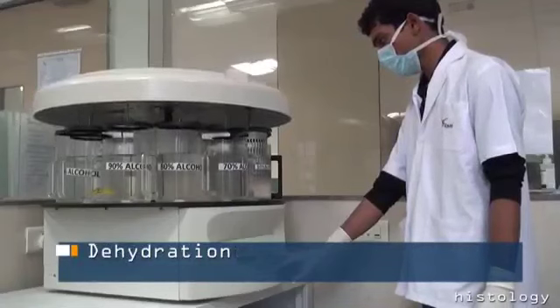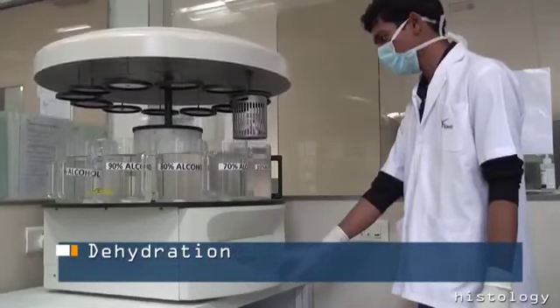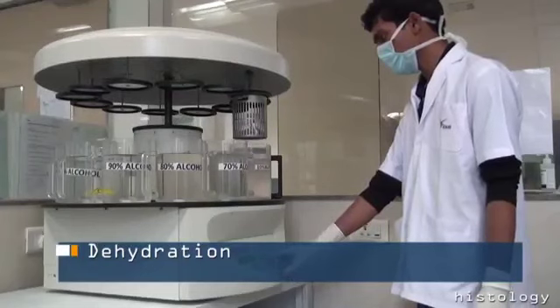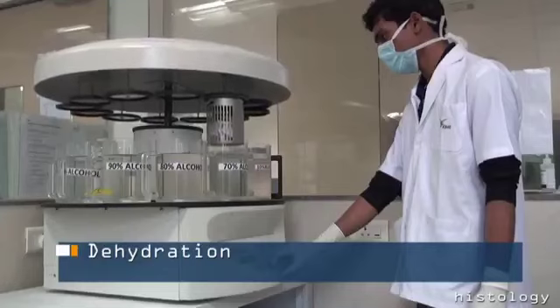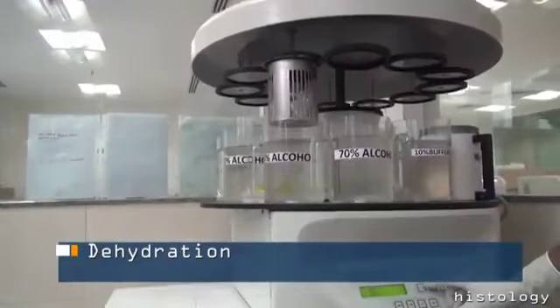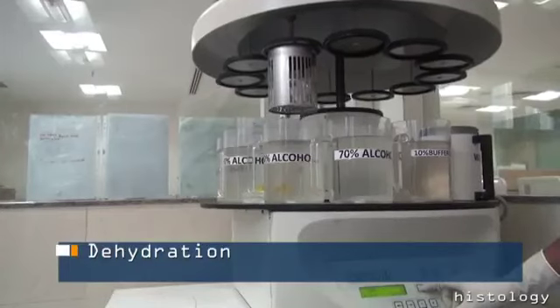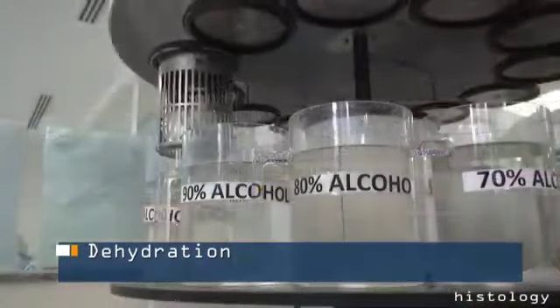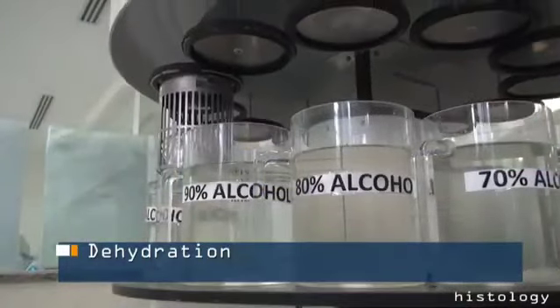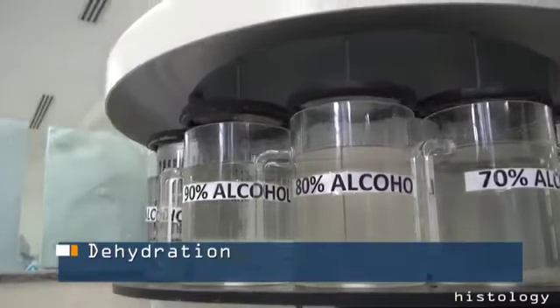Dehydration. Water is present in tissues in free and bound forms. Tissues are processed to the embedding medium by removing the free water. To minimize tissue distortion or shrinkage from the dehydrant, delicate specimens are dehydrated in a graded ethanol series from water through 10%, 20%, 50%, 95%, 100% ethanol.